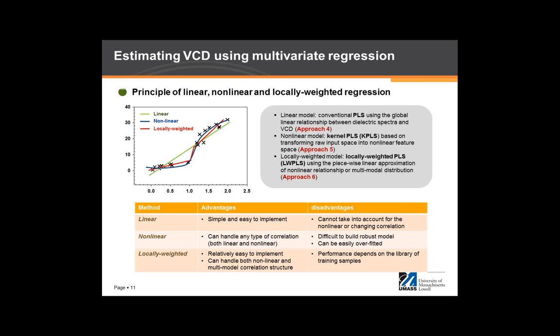And then on day 5, you are estimating based on the data set collected from day 3, 4, 5. So this way, you are moving your data set for the regression, but by doing that, with an adaptive data set, you are able to adapt to correlation structure change.